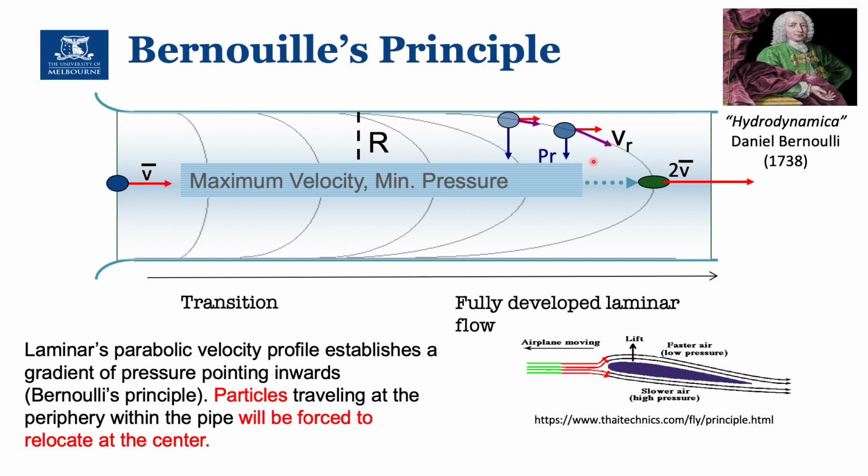But in the case of cytometry, the practical application of this is that once you inject particles in a flowing stream, they will rarely touch the walls. And they will tend to slowly and gradually locate around the center, where the velocity is maximum and the pressure is minimum. So you get some sort of alignment just by the fact that you're running things on laminar flow.